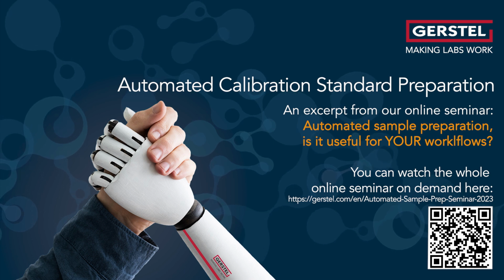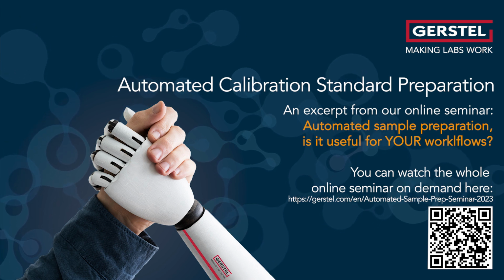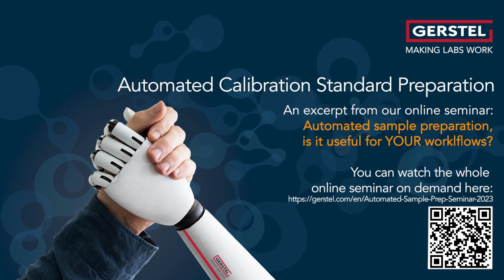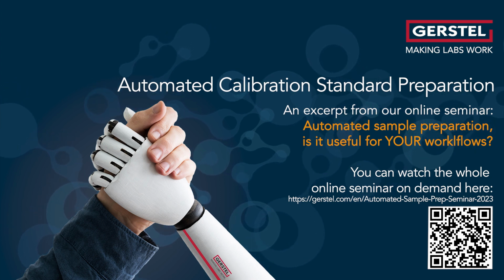In this video, we show you possibilities for automated sample preparation. This is an excerpt of an online seminar from January 2023. In our YouTube playlist, you will find more automated workflows, as well as an overview of possibilities to automate your own sample preparation workflow.